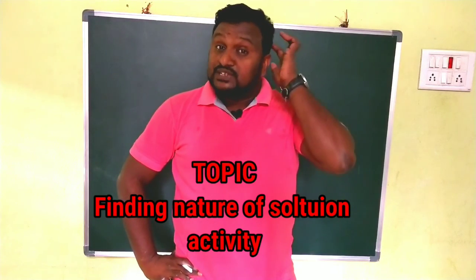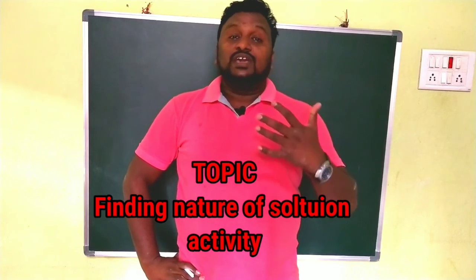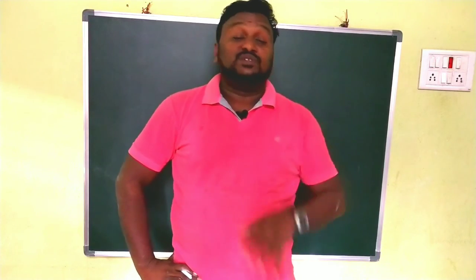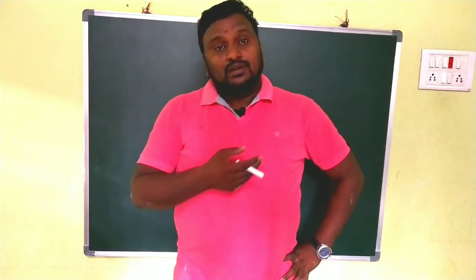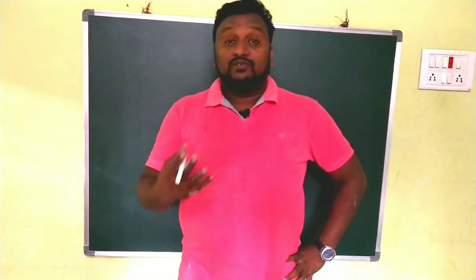And today I am going to explain how we can find out the nature of the solution. When we have a number of solutions, how can we find out the nature of the solutions by using one activity? Generally by using some indicators we may find the acid or base, but here one activity is there. Based upon that, how can we find that out?